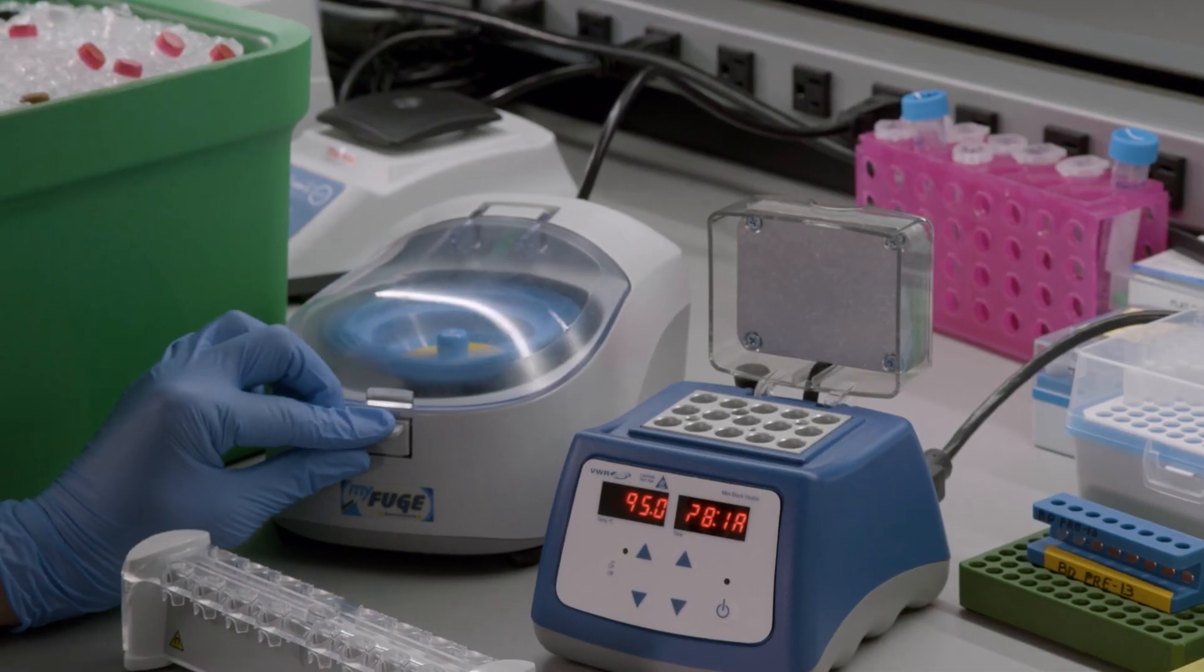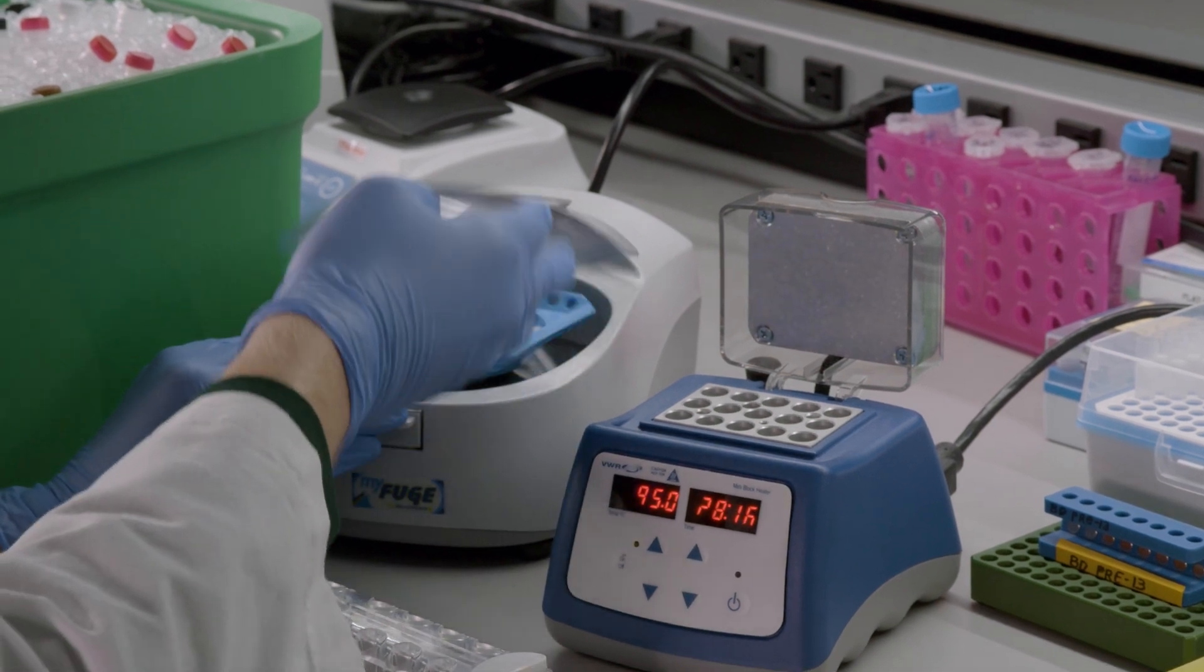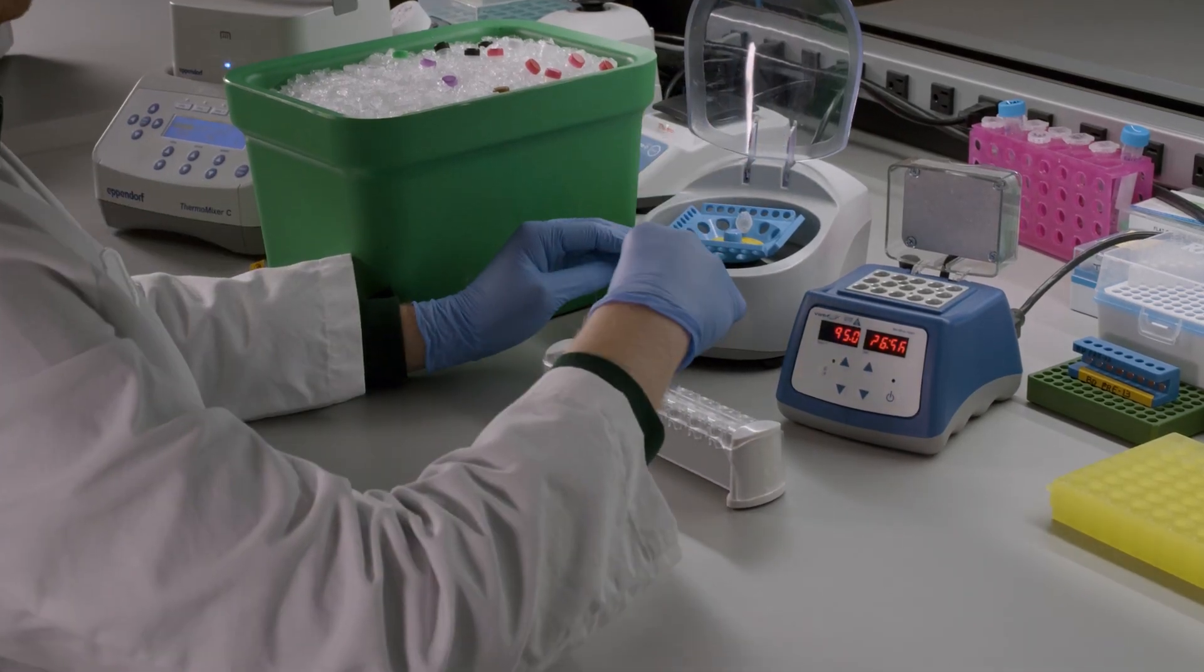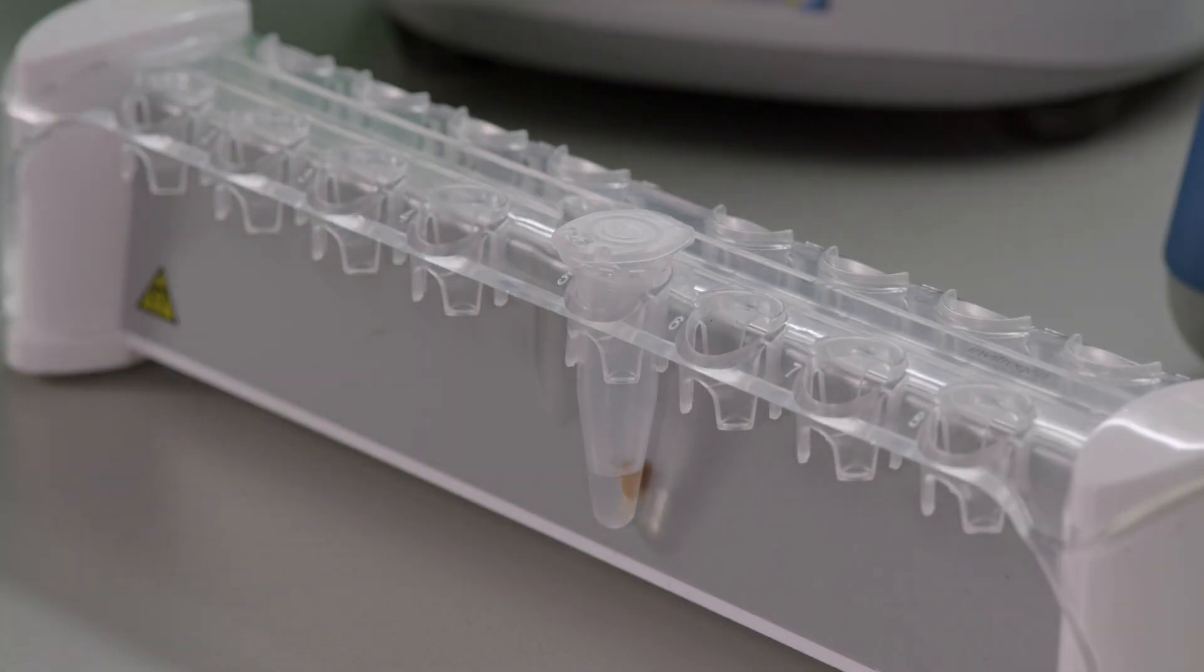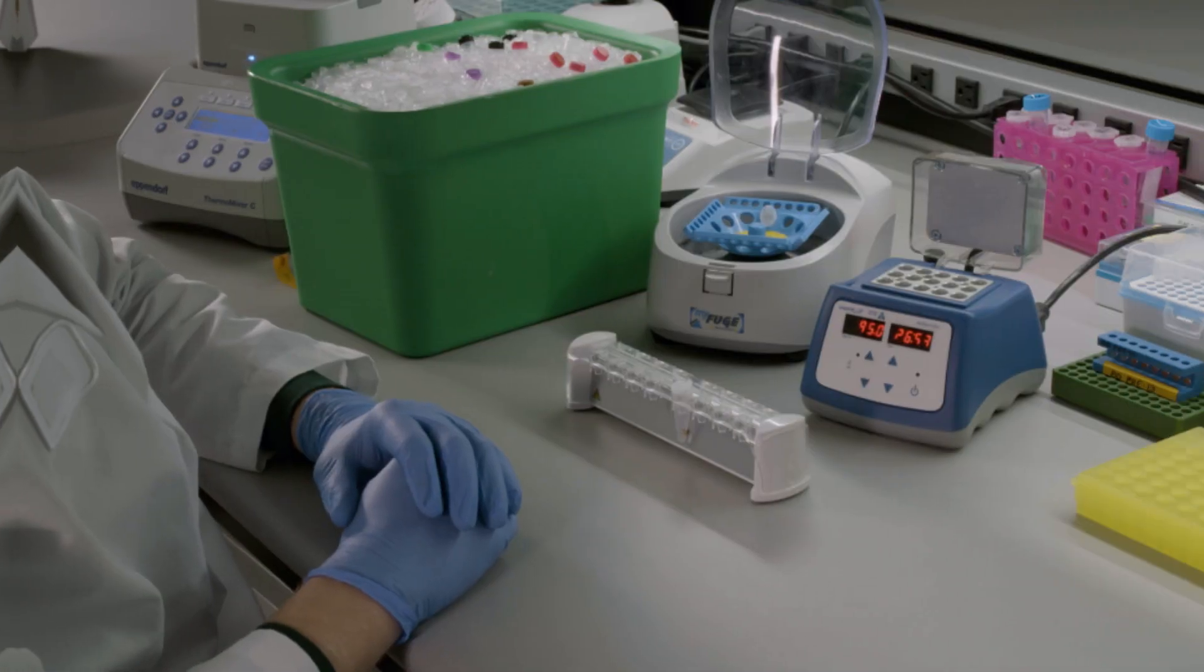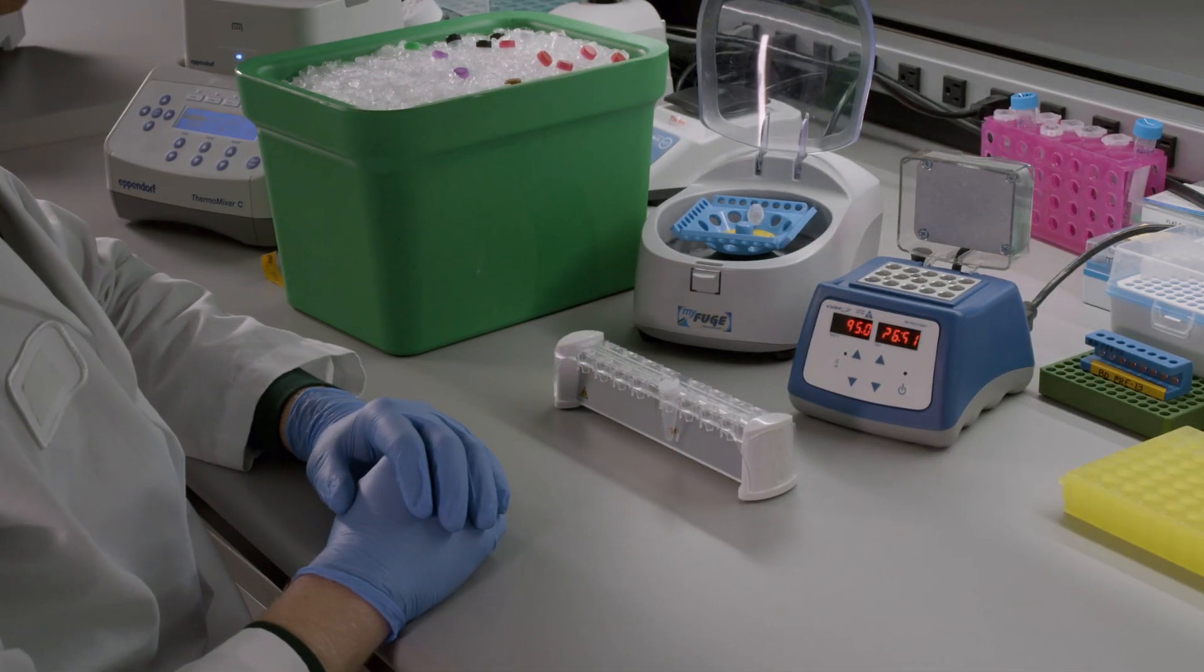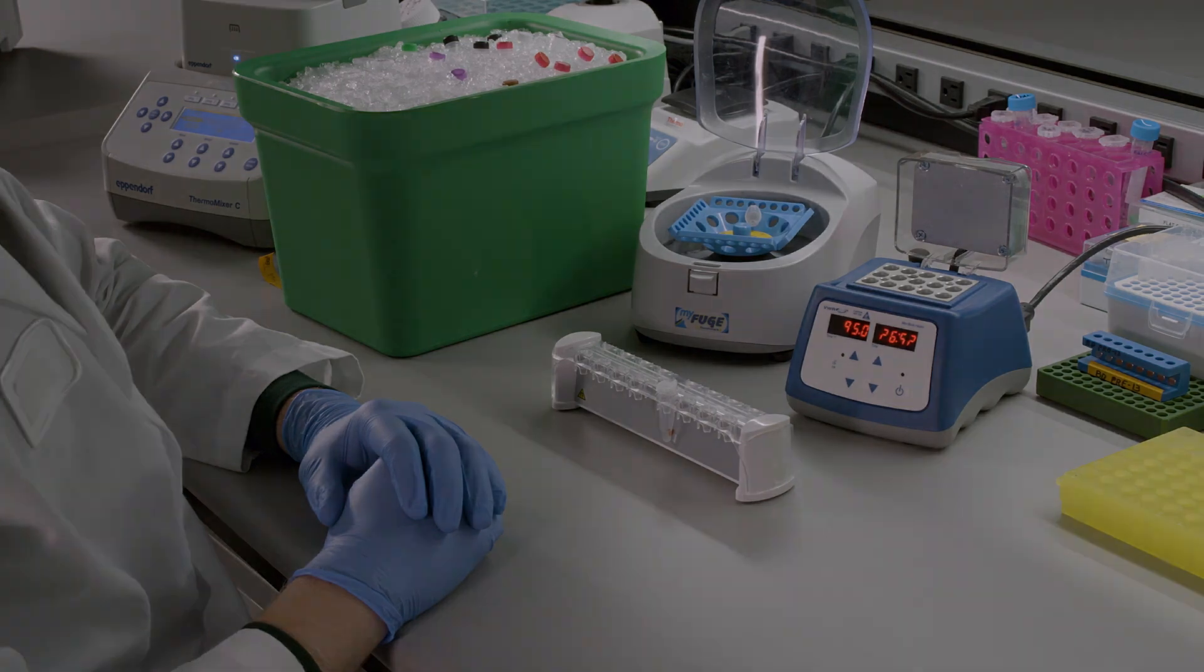After incubation is complete, briefly spin the tube then place it on a magnet until the beads bind to the side of the wall. If you used AbSeq or sample tag antibodies during the experiment, save the supernatant for future processing. If no antibodies were used, like in this example, the supernatant can be discarded.